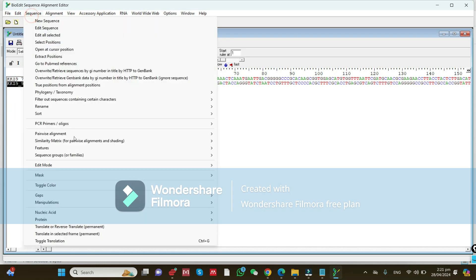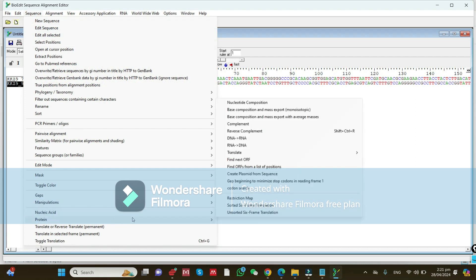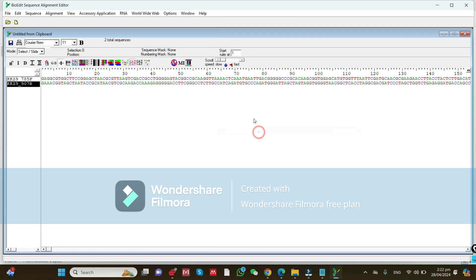Go to 'Nucleic Acid' and click on 'Reverse Complement'. You can see these sequences, and when you click on 'Reverse Complement', all these sequences will change. Look carefully — all the reverse sequences have now been changed.